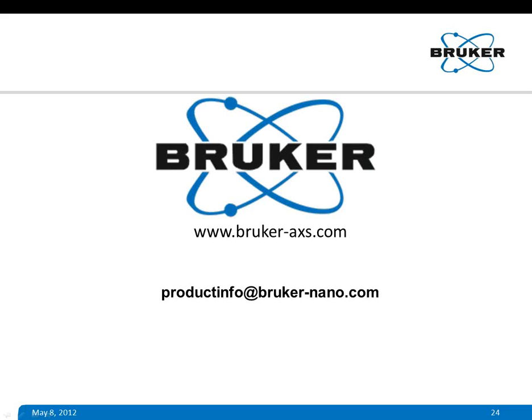But for measurement of corrosion with wear, when wear is involved and you do electrochemical polarization study to measure CW, then there might be interactions of the area where corrosion is taking place and where corrosion is taking place, but there is no tribology like mechanical wear taking place because of asymmetrical area. In that case, you prefer to prevent it somehow, either by some kind of unreactive coating on the surface, or we have a different methodology not using ball or pin, but you can use a cylindrical surface where entire surface will be covered for mechanical wear, and it will not add any error.